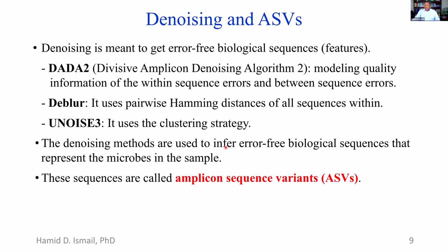And this word, infer, is very good, because it cannot guarantee 100%. It is a matter of prediction, right? But the inference here is really very powerful because it is tested, and it will try to get to the right biological sequence, the one that you can use to identify bacteria and feel confident that this is the right sequence for this purpose.